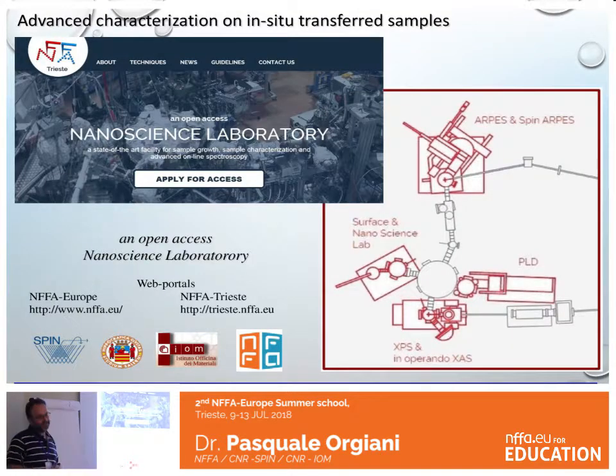Okay, now we finished this introduction on PLD. And so you see, okay, all this headache has some good news. Yes, fortunately, there is some good news. And the good news is that you can grow a very large variety of samples. I would say you have definitely more flexibility with PLD than any other system, because in PLD what you are doing is ablating a target of a material. You change the target, you change the material. This means that, for instance, in a PLD, at the same time, I could have one oxide and one non-oxide material. Probably they will kill you. On the contrary, here, the elements are provided by ablation. So you change the target, you change the material.